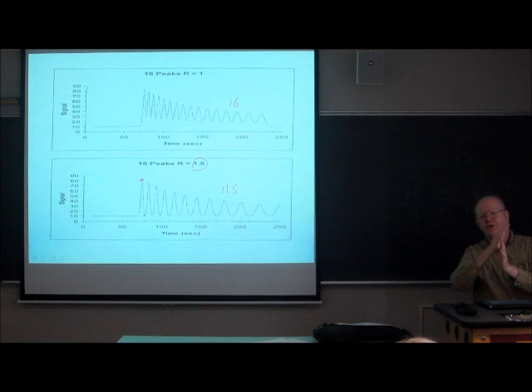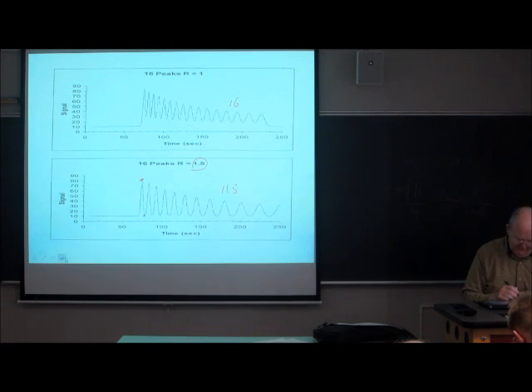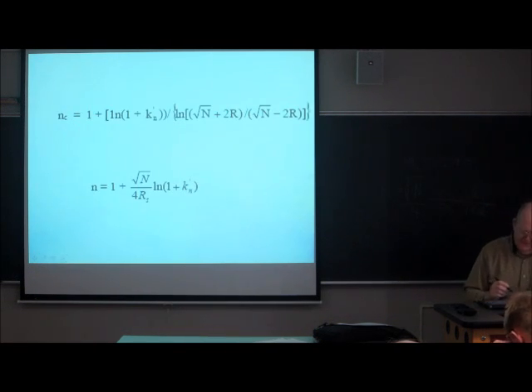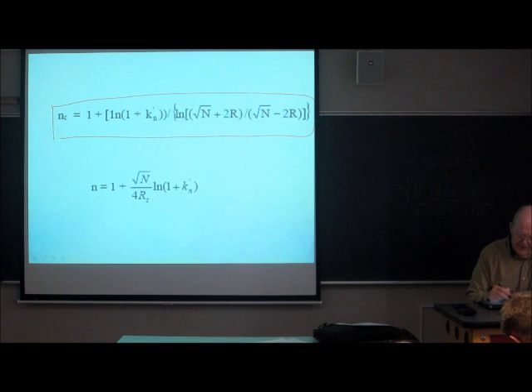4 sigma units over. And if I want the third peak to be resolved by R of 1, that has to be over another 4 sigma units, and another, and another, and another. You can do the math, as they say, and the math works out this way, where K prime N is the retention factor of the last peak.